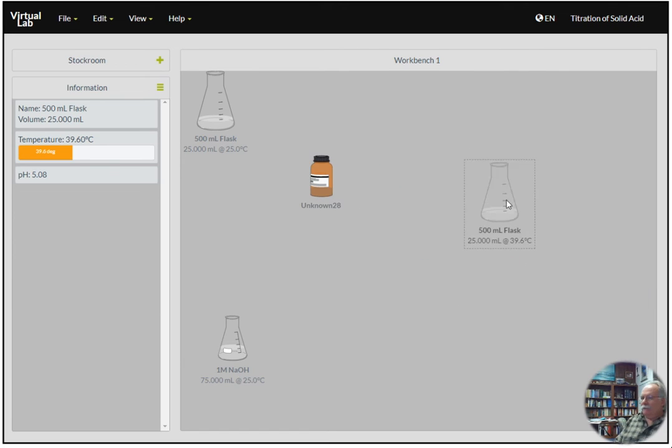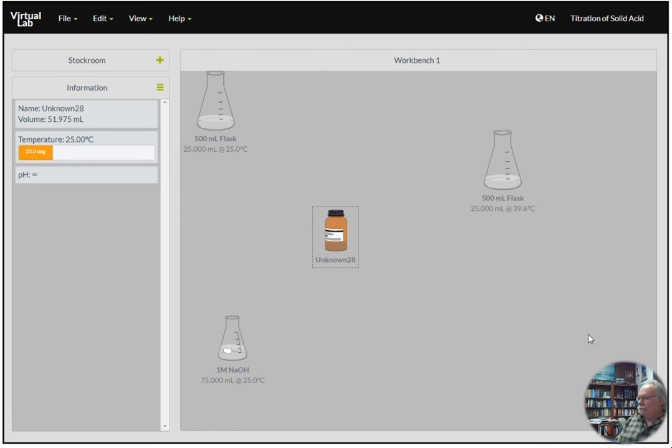So what you want to do is take 3.4 grams of this unknown solid, dissolve it in some water, and do a titration. And if you use this concentrated 1 molar NaOH, it will take you somewhere around 25 mils. It may be a little bit more because I underestimated the equivalence point. But it's definitely within the range of your volumetric apparatus, and you'll be able to run your experiment.